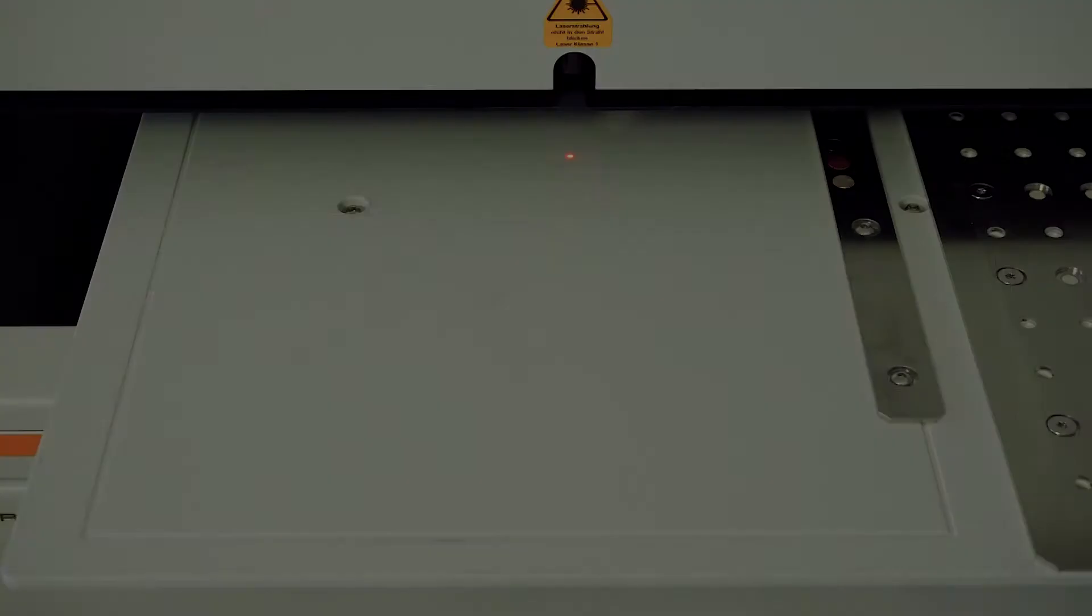Thus, we also achieve a very high measuring speed. Automated measurements are easily performed using the pattern recognition.